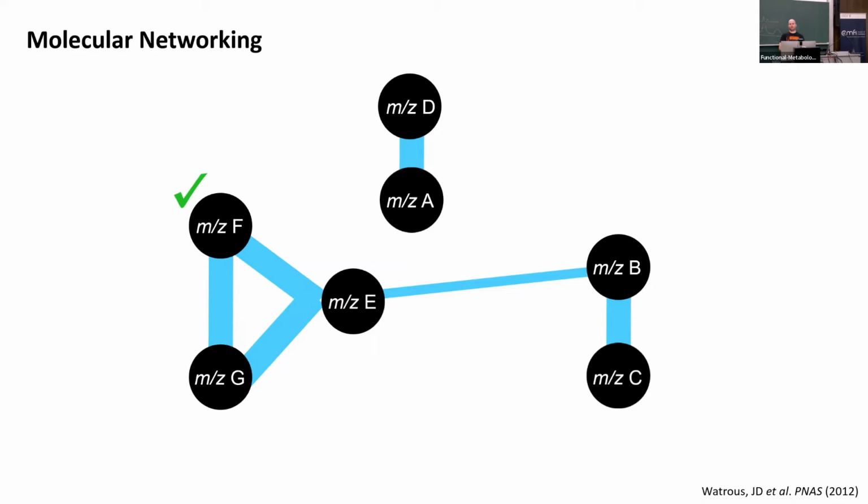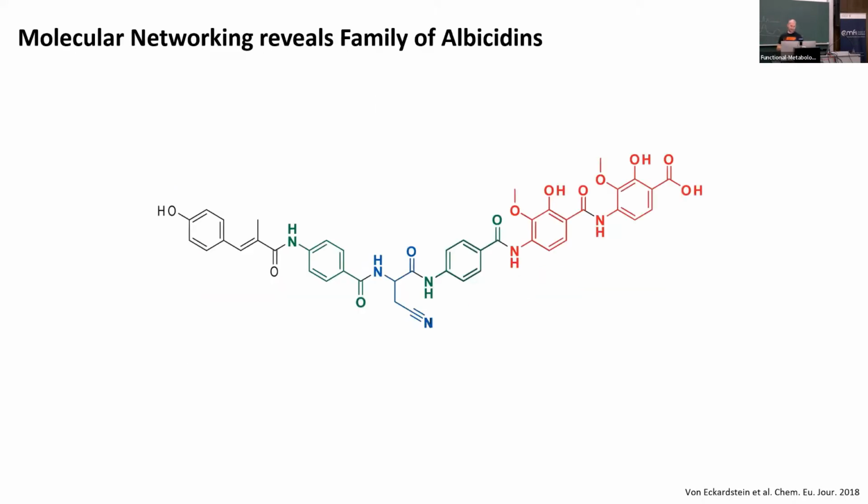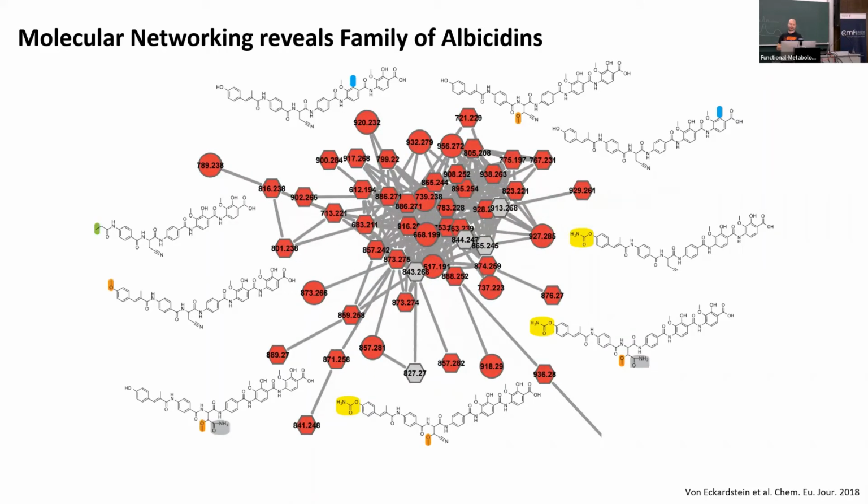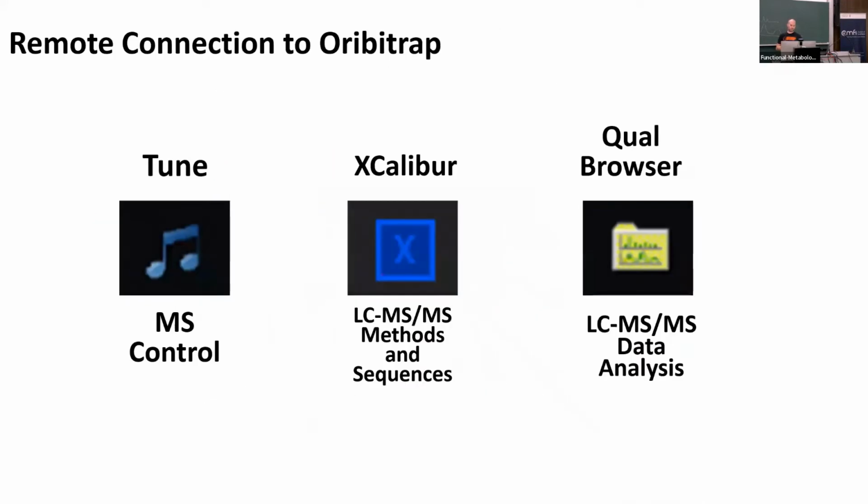That was before I knew about molecular networking. When I learned about it and systematically reanalyzed that non-targeted data I had, it was really interesting, because all these other molecules would also appear, and I thought, oh wow, that's an even bigger network, and there are way more analogs inside of that data than I thought. So I think this is really useful, and in the next couple of days we will show you how you get this from our test data, but then hopefully also your own data.